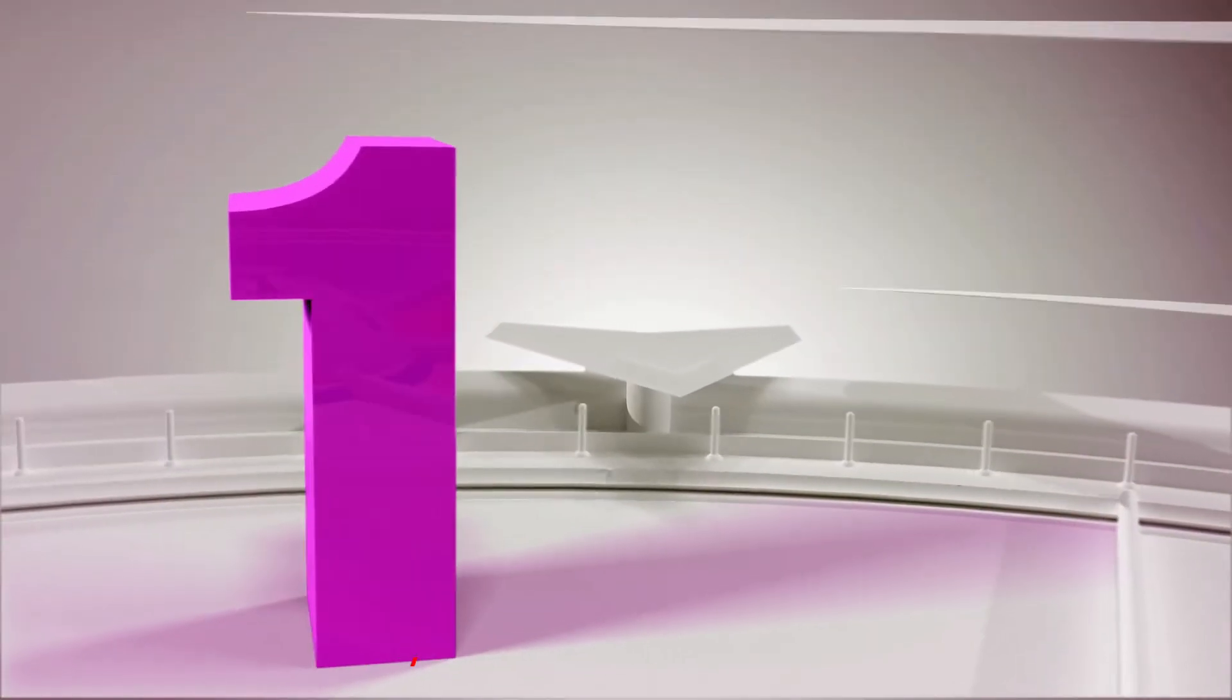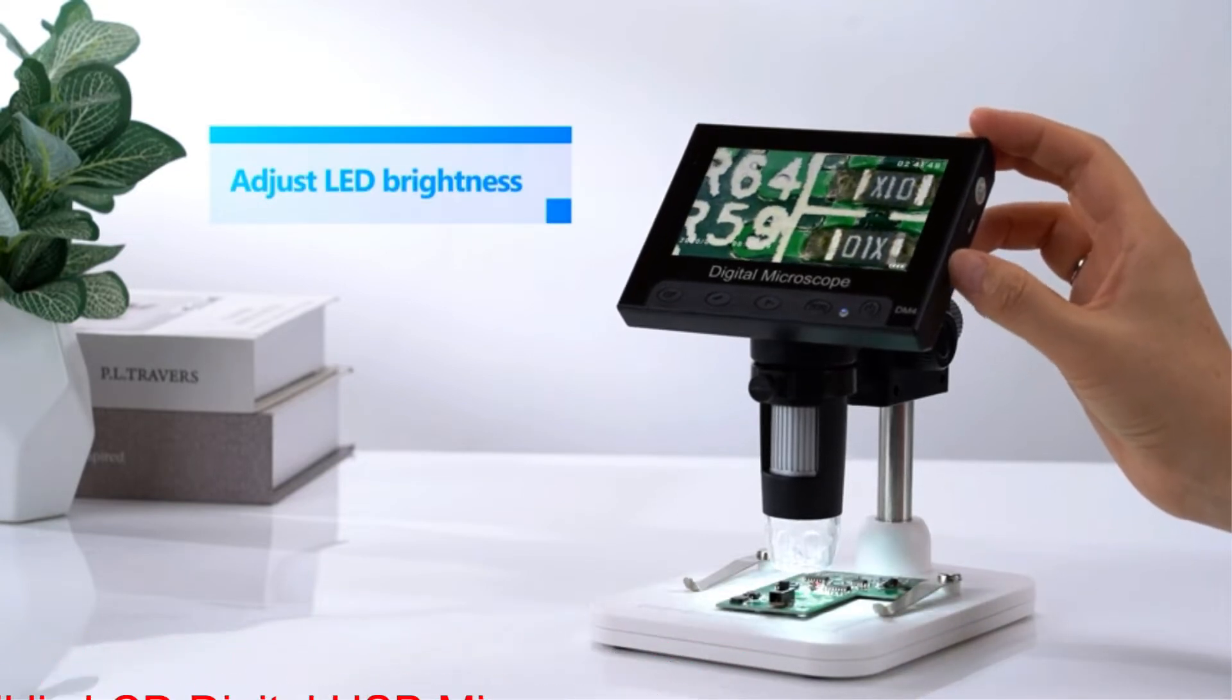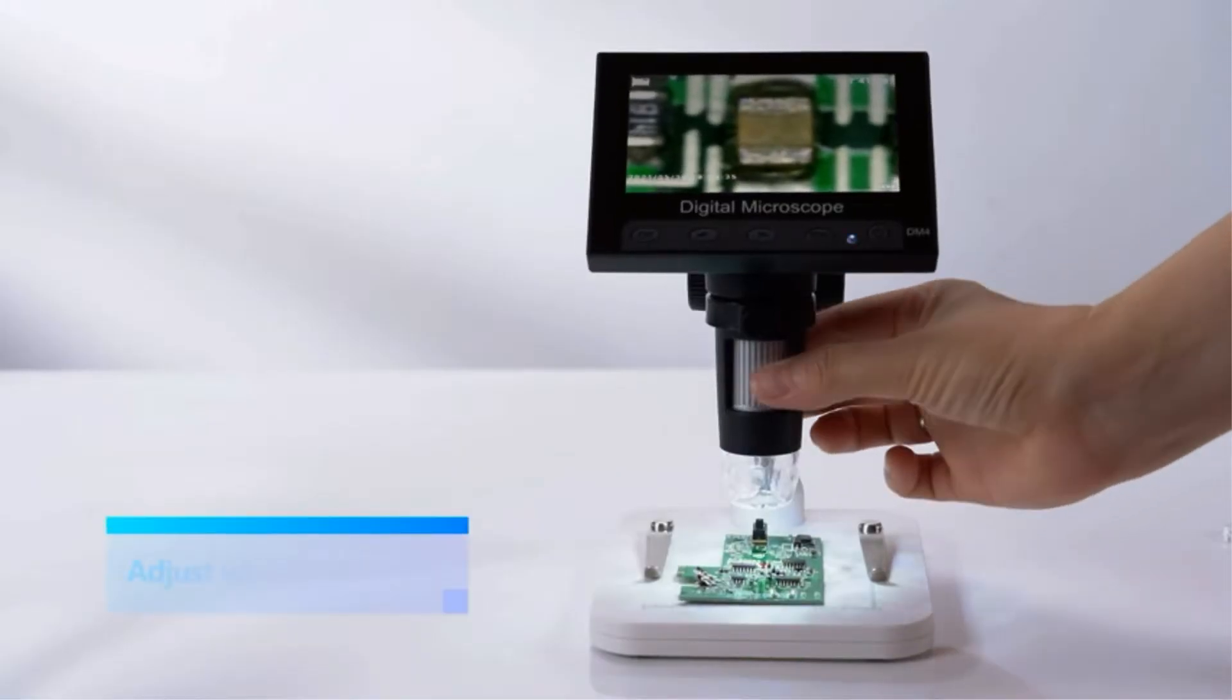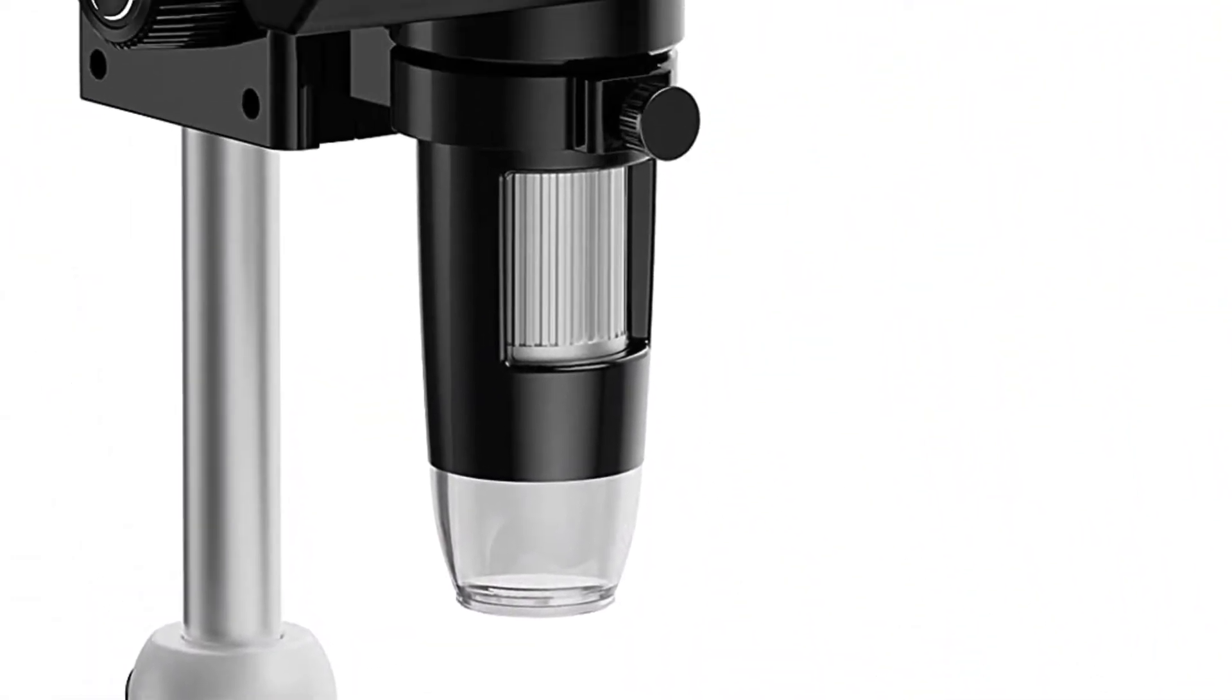Number 1. Elliclove LCD Digital USB Microscope. If you are on a budget and want something affordable, then you should check out Elliclove and its digital USB microscope offerings, since they are quite cheap but still offer various features.